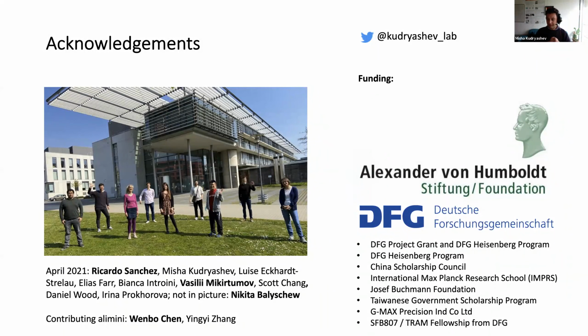Okay. And then we've got time for a couple of questions which are kind of linked in my head here, which is: is Susan written with a similar alignment refinement strategy to Dynamo? Could you give us a little bit more detail about what's going on there? And linked to that possibly is, how does Susan fare if the sample gets more crowded?